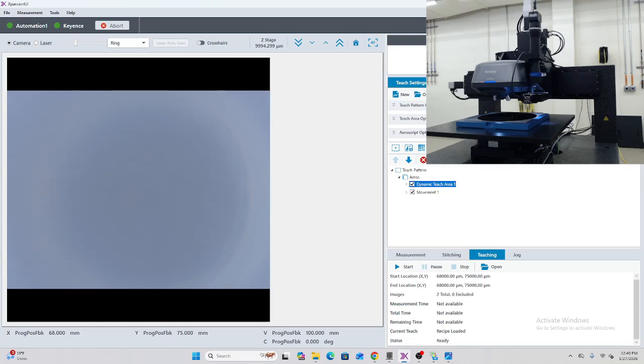Through our microscope automation software, XpansionUI, we have integrated surface pre-inspection using machine vision cameras. Now, we have the ability to use the high-speed camera to scan the entire surface of interest quickly, and then automatically drive the microscope to analyze the locations that the camera identifies. This is an obvious fit for analyzing surface defects that are at different locations from part to part. It can also be used for determining other features of interest using any of the available vision tools and AI modules. This demonstration will show you how to combine the power of the microscope with the power of machine vision pre-inspection. So let's take a look at the hardware that we're running right now.